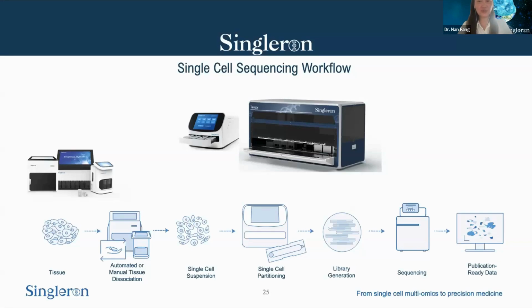Like it can also generate the quantity information of RNA at single cell level to give you annotation of the cell types, pathway information, gene expression information.